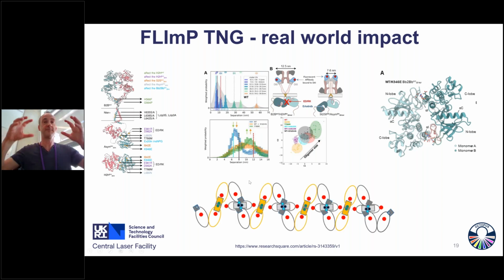But the result of all this vast amount of work, which depended on this new extra high resolution FLImP automation and particular molecular dynamics simulations, and what goes on in Marissa's head, was this model for ligand-free oligomerization. So this is like a top-down view of the oligomers, and particularly what happened is we identified 2 previously orphan interfaces, interfaces which seem to be important after all. So this came entirely from what we call the 1D FLImP, so just measuring separations.